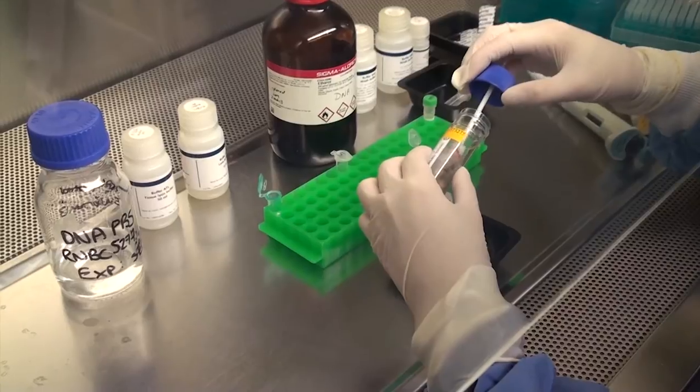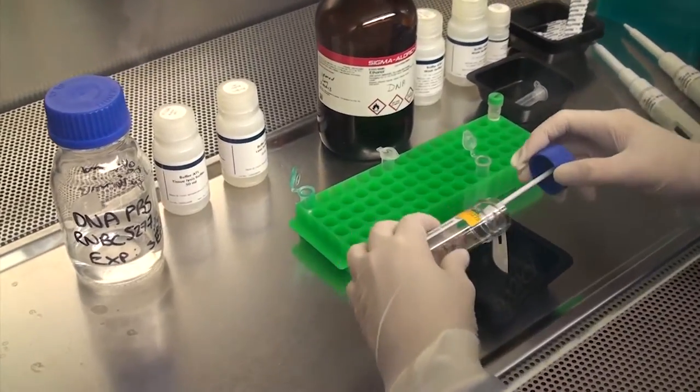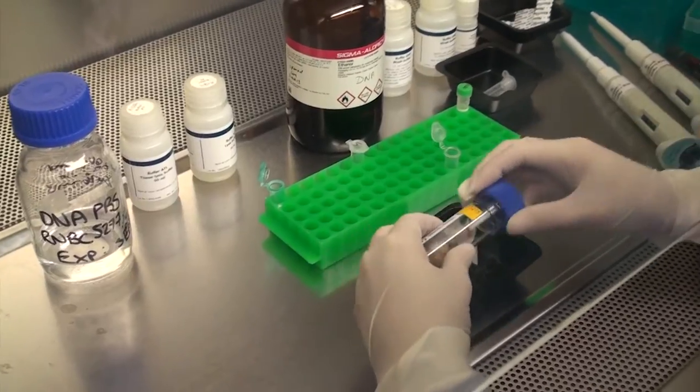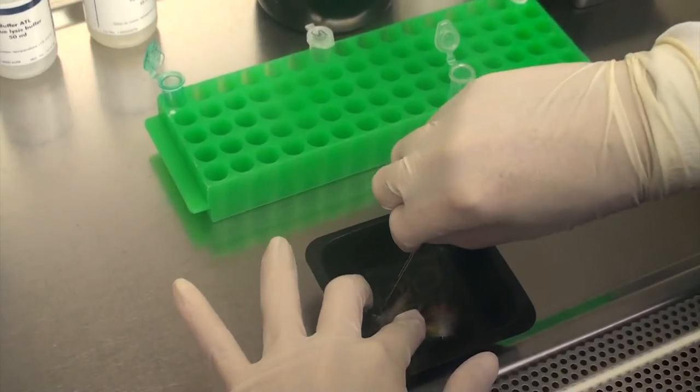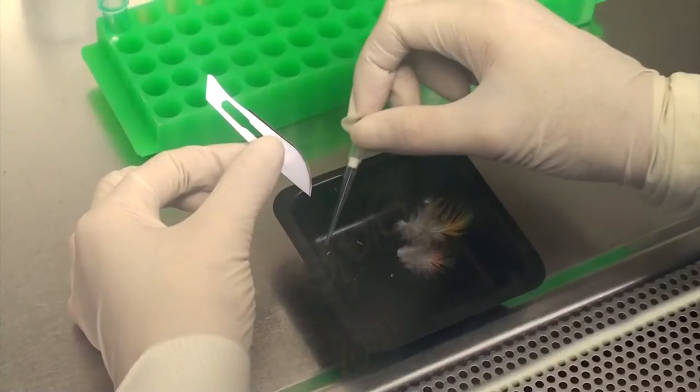In the lab, the tips of the feathers are cut off and transferred to a new tube containing a special reagent. These are mixed together and heated to release the DNA from the feather tip. This process takes at least two hours, after which the mixture is combined with more reagents to clean and purify the DNA.